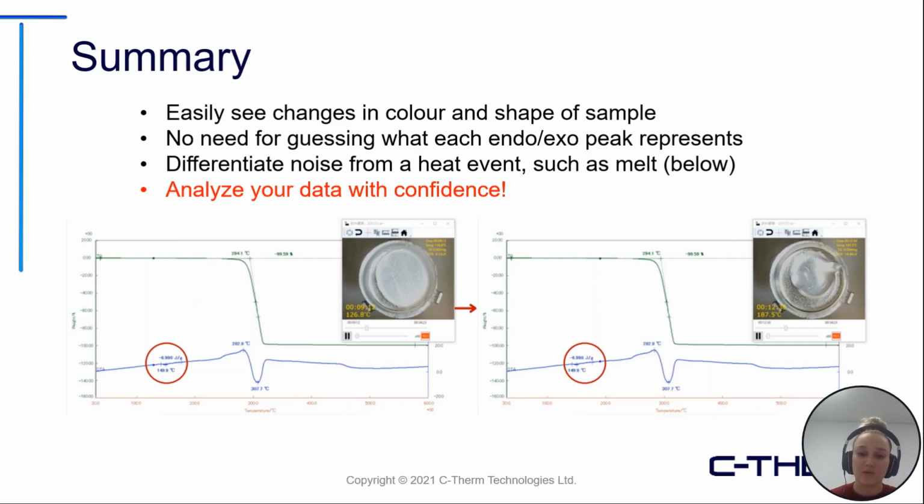Such as that melt, if you remember in the PHBH application there, the biopolymer, it would have been really hard to determine that was a melting point without the sample observation. I know back in my DSC days, I probably would have just discarded that for noise.